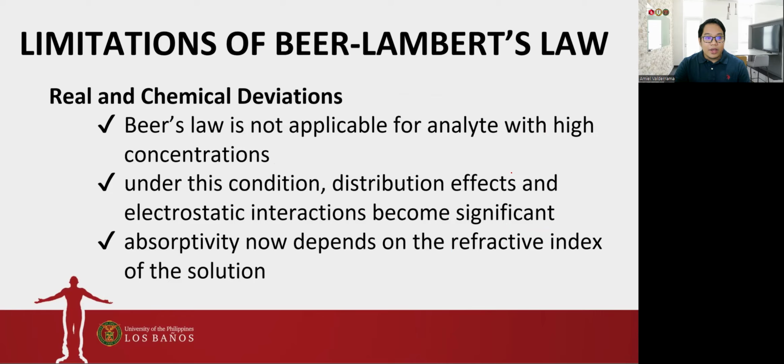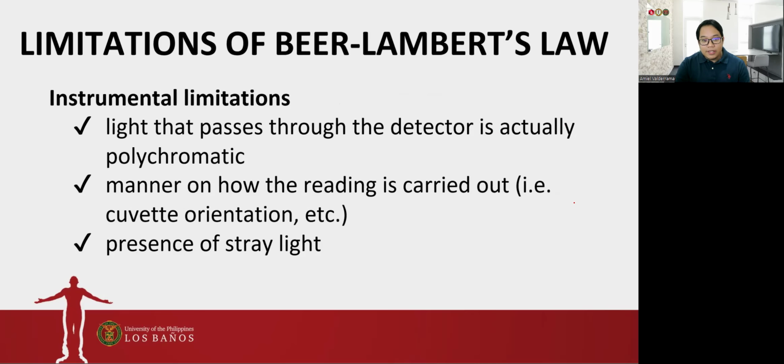Yung sa real and chemical, ayan. So Beer's law is not applicable for analyte with high concentration as mentioned earlier. Next, under this condition, distribution effects and electrostatic interactions become significant. So ito yung nangyayari sa ating chemical deviations as well. Next, absorptivity now depends on the refractive index of the solution. Next is we have the instrumental limitations.